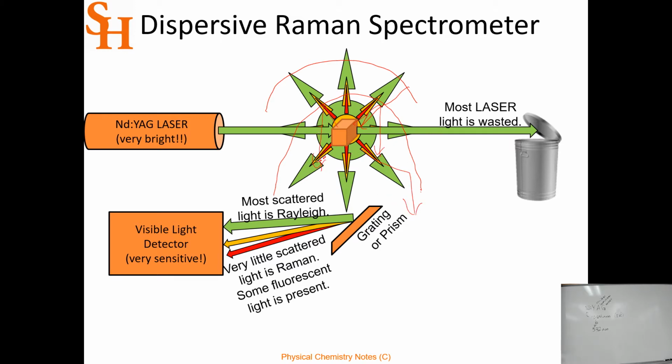So there's a use of your geometry. Remember back in the day, taking the sort of center burst and collimating the rays on a parabola? You can do that with this and then have collimated light coming out the bottom. And then it's still pretty spread out. And so then you use telescopic optics, like a telescope, to take this collimated light that's this big and shrink it down to collimated light that's this big. So you can use Cassegrain optics to tighten that beam and get it onto your spectrometer. Yeah, focus it, but also get it tightly collimated so that it can hit the grating collimated and come off dispersed.